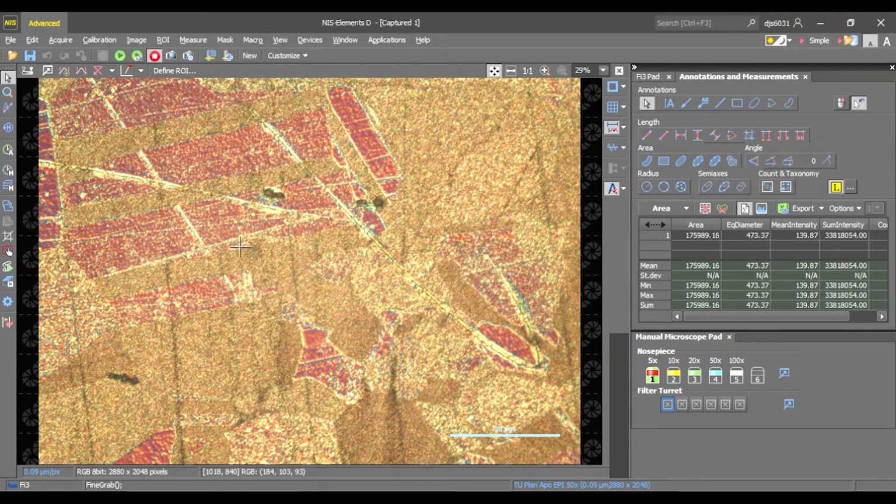Please don't change the calibration. If it needs recalibrated, please reach out to somebody who is trained to do the calibration. Currently, each lens is calibrated to the right distance, and we should never have to change that unless it somehow gets messed up in the software. So please don't mess with that.